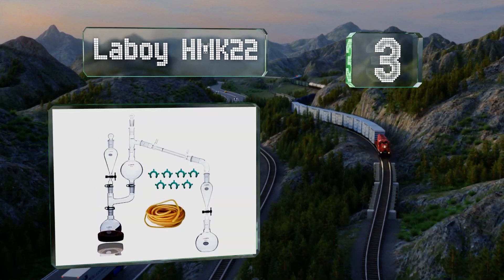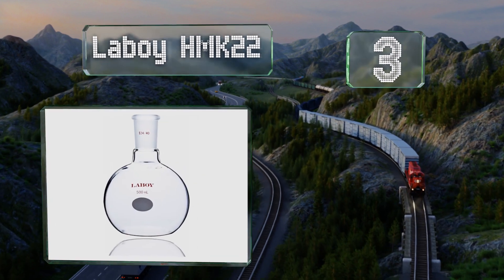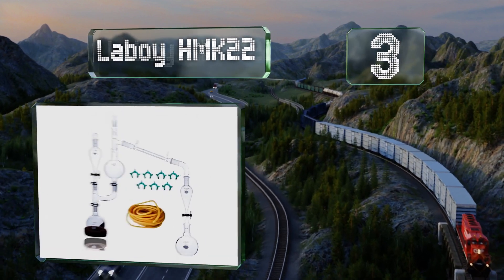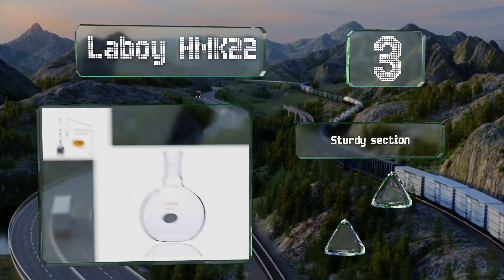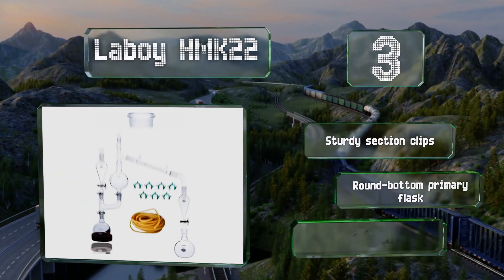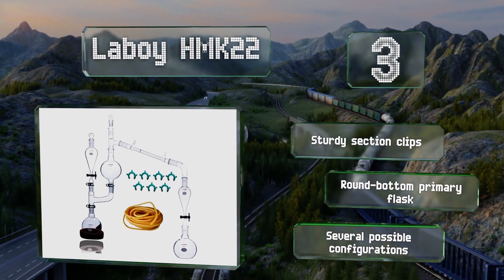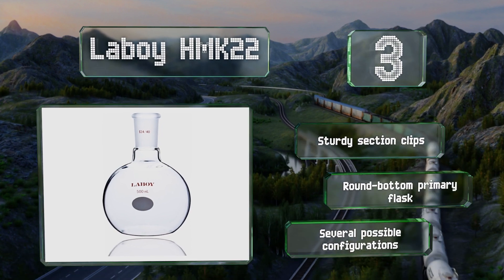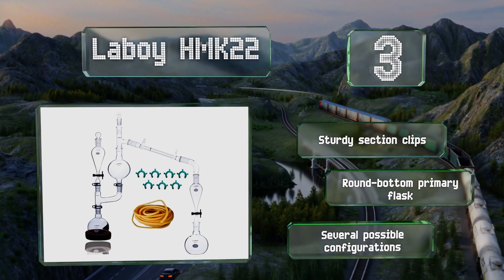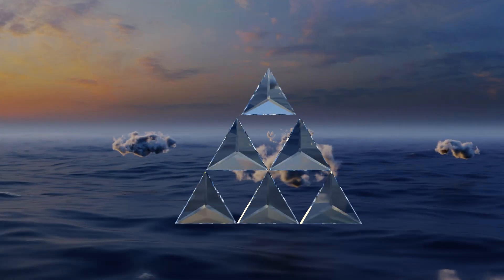Nearing the top of our list at number three, to ensure that the Lab Boy HMK 22 doesn't leak, each joint undergoes an extra round of hand grinding. It's the perfect size for creating small amounts of essential oils or just for learning how the process works. It comes with sturdy section clips and a round bottom primary flask, and it offers several possible configurations.